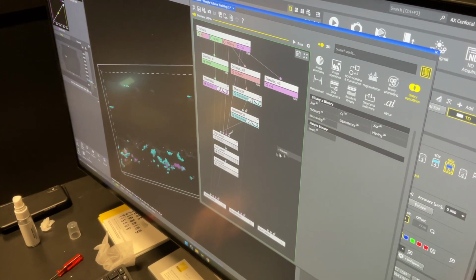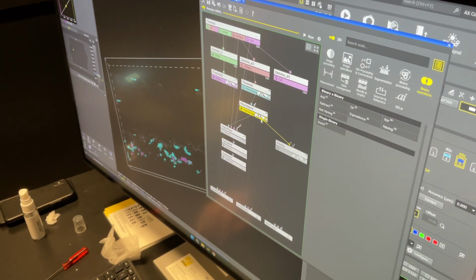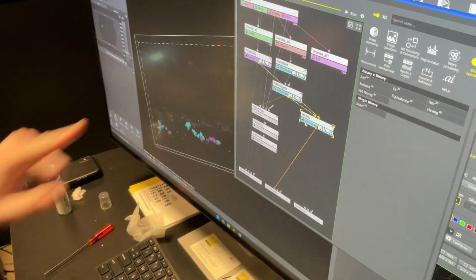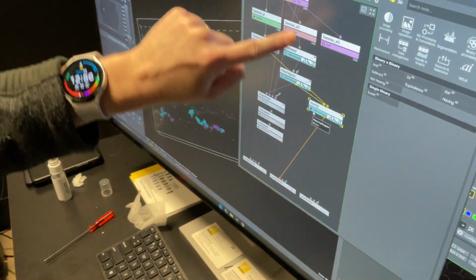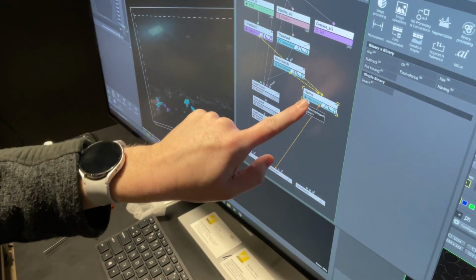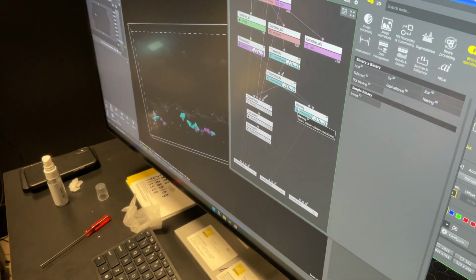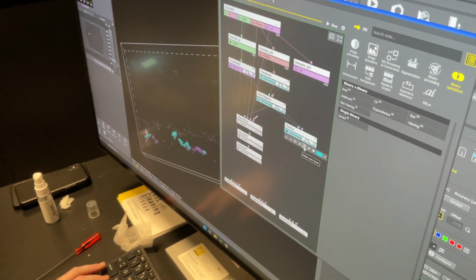And then I'm going to take my having tool and say, give me all of the macrophages. That's A. Having B. Having bacteria. And you'll notice A is flowing through, right? So you can always tell what the master layer is, because the next layer down is the same thing. And I can only have one of these active at a time. That may or may not be what I want to do. I can still measure. I don't have to do the next step, but I like to. So I'm going to right click on this one, and I'm going to tell it make a new layer.